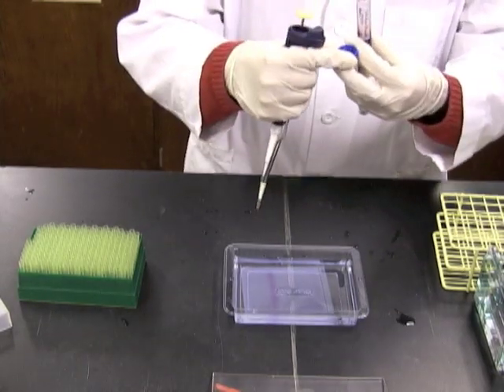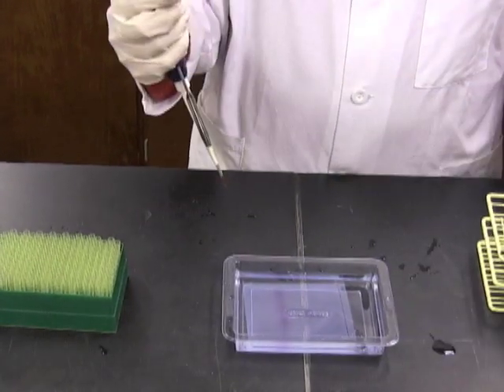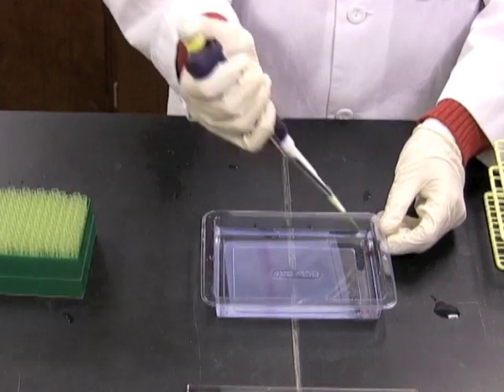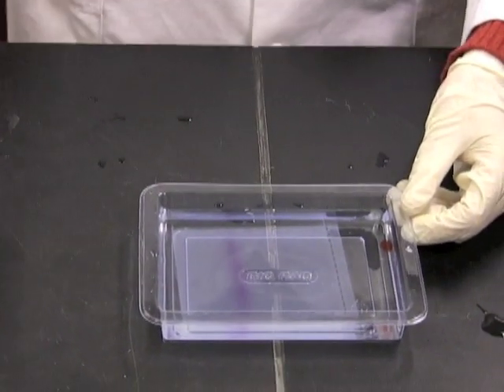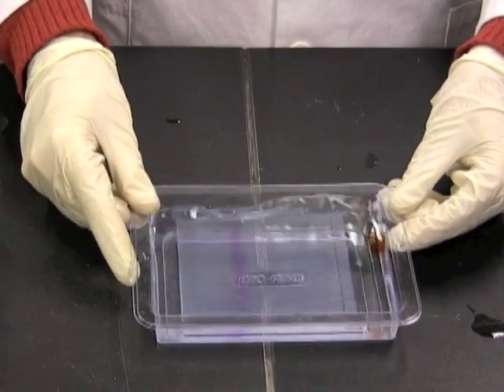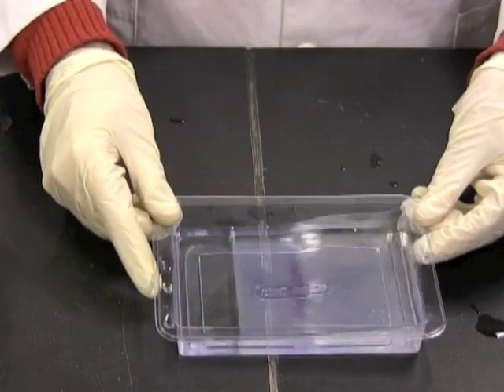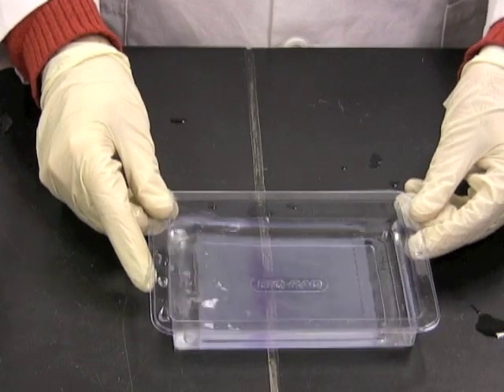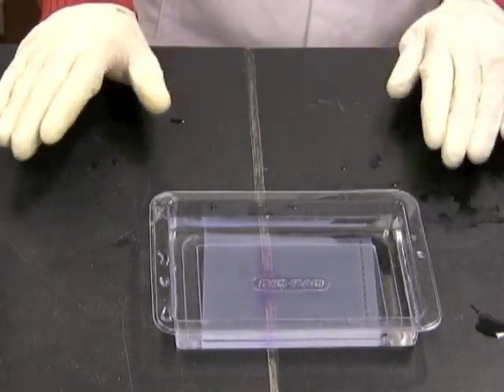Now, since I've already added the gel to the staining tray, I'm going to add the ethidium bromide to the water beside the gel. And then I'm slowly going to mix the stain into the water so that it's uniformly distributed. And then you need to wait between 5 and 10 minutes before you visualize it on a UV light box and take a picture.